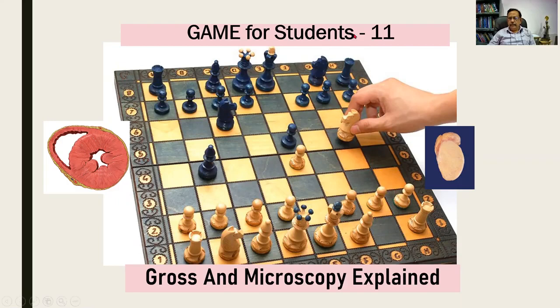Game 11. Gross and Microscopy Explained. In this class, we shall have a couple of gross specimens which can be kept for your spotter, practical, viva, and also form part of the theory in general pathology.